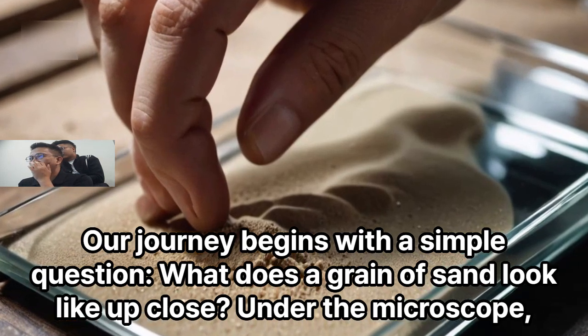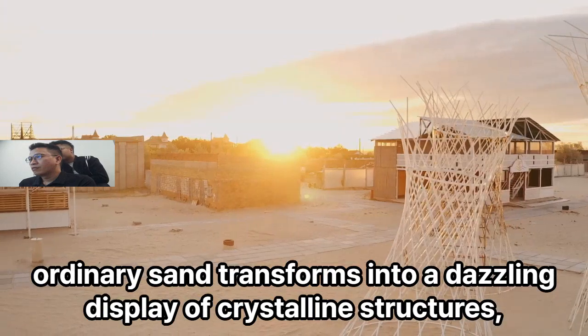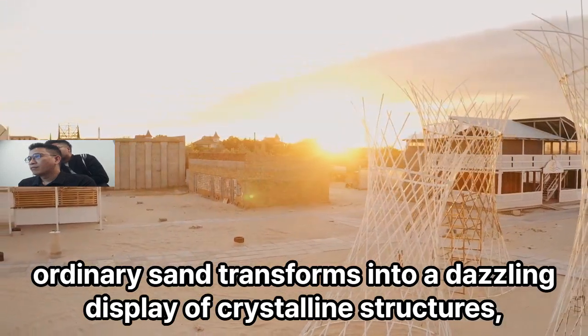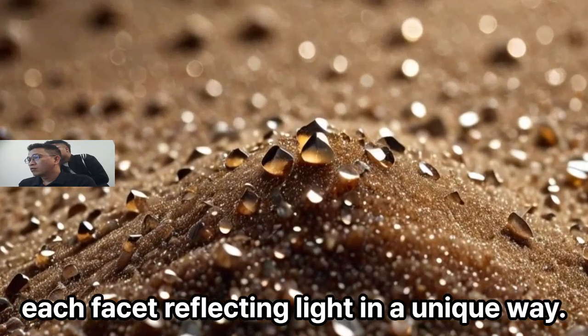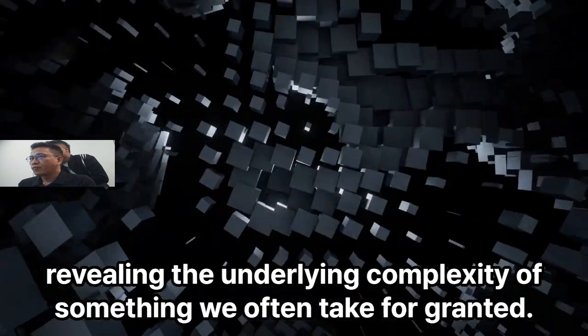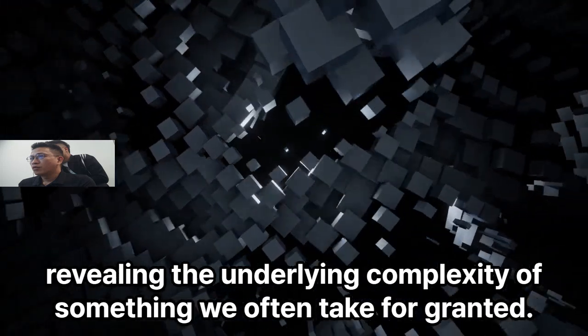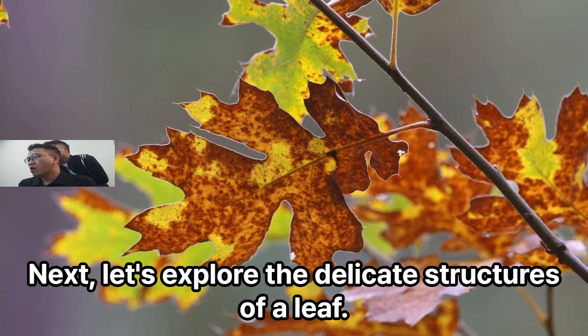What does a grain of sand look like up close? Under the microscope, ordinary sand transforms into a dazzling display of crystalline structures, each facet reflecting light in a unique way. The play of light and shadow highlights the intricate details, revealing the underlying complexity of something we often take for granted. Next, let's explore the delicate structures of a leaf.